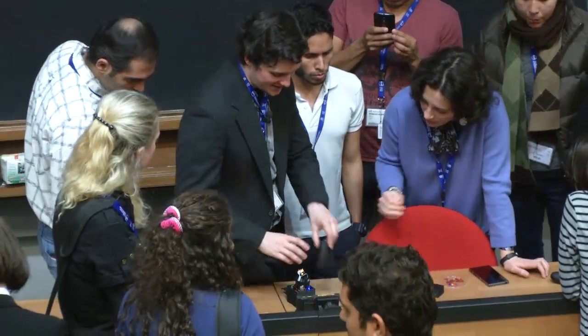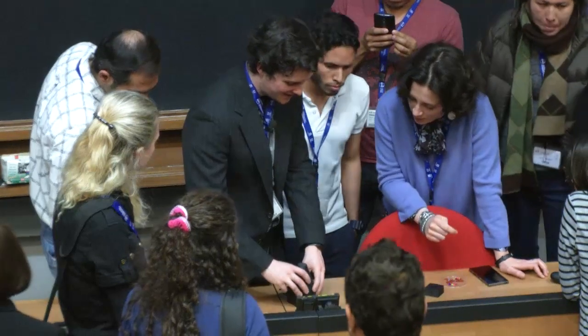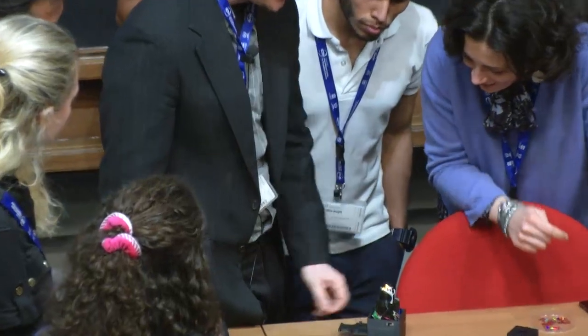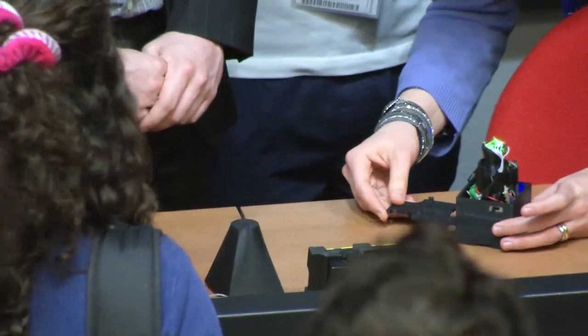This is the cap for this. I think it looks cooler like this, yeah. This is where you put the sample.